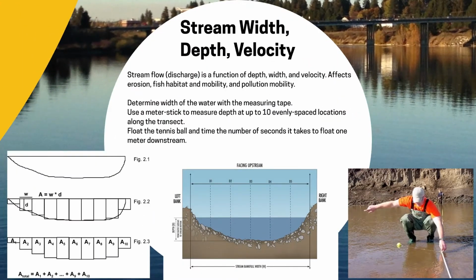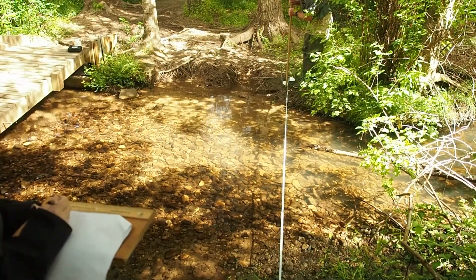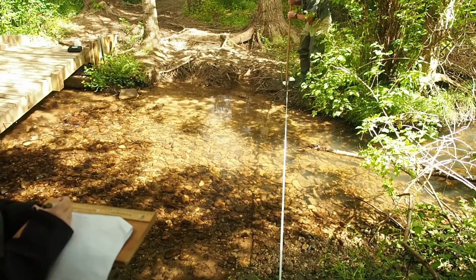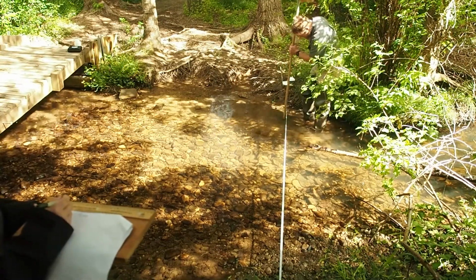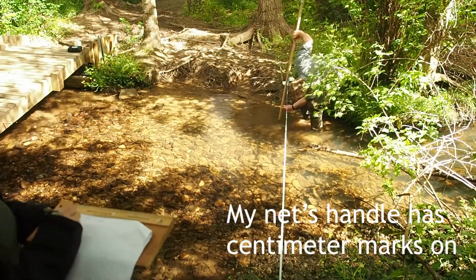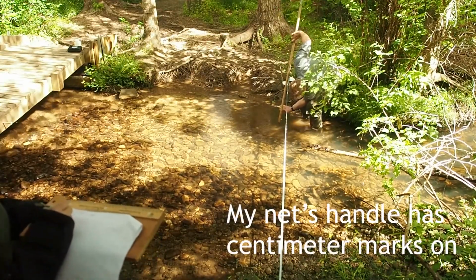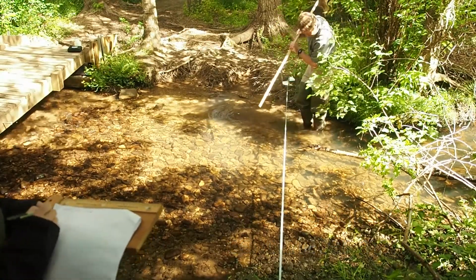The amount of water flowing down a stream can be measured with simple tools. Flow is a function of the width, depth, and velocity of the water. First, measure the width of the stream from the ordinary high water mark on the left bank to the right bank's high water mark. Then, use a meter stick to measure the depth at 1 meter increments out from the edge of the water. If the stream is 2 meters wide or less, just measure once in the middle. While you're at it, find the maximum stream depth and record that on a separate line on the form.